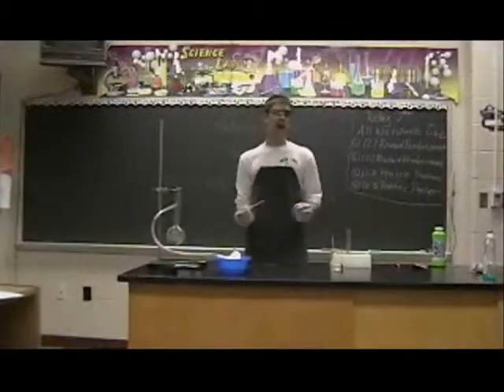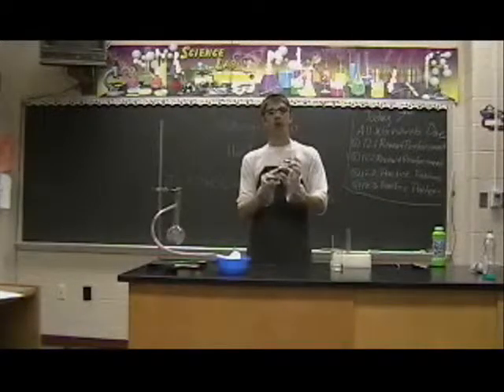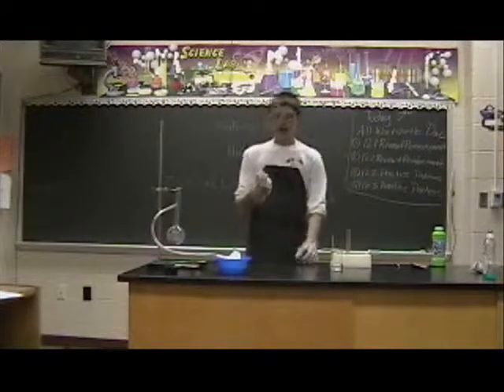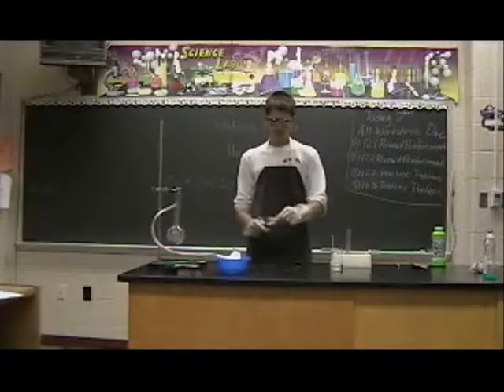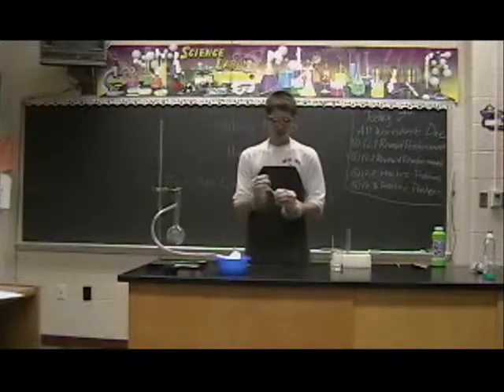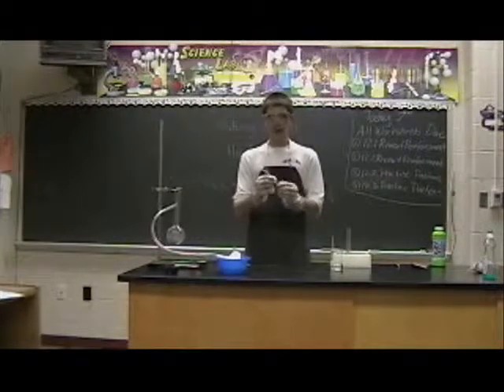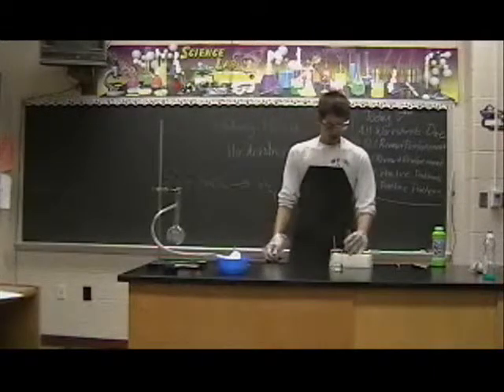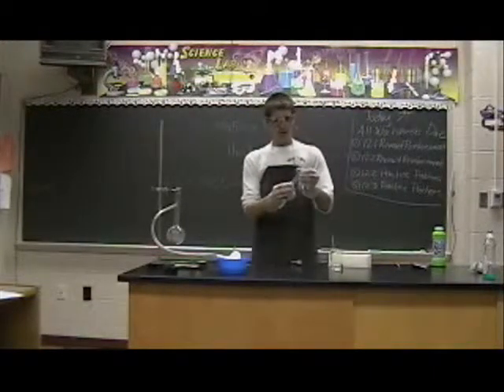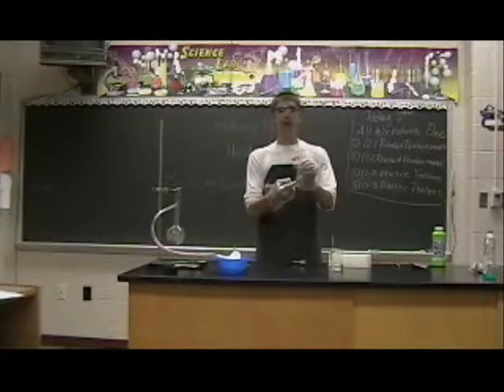Now we're going to start making the micro Hindenburgs. First, you take a rubber stopper with a hole in the middle of it. Then you take your micro pipette and cut the end off of it. Then you put it in the hole so it goes pretty much all the way through, so that gas can come up through here while the bubble solution is in the end. Then you take the test tube, put the granulated zinc in there, and put the rubber stopper into it.